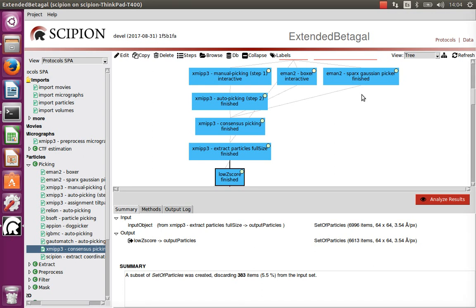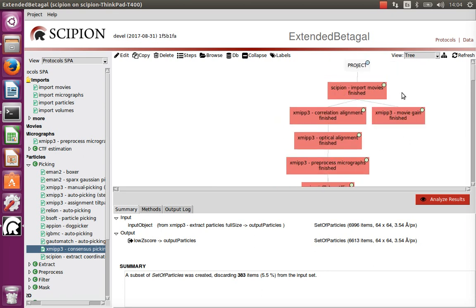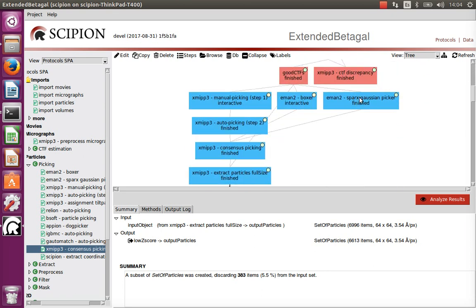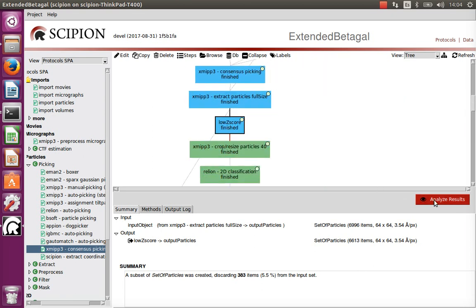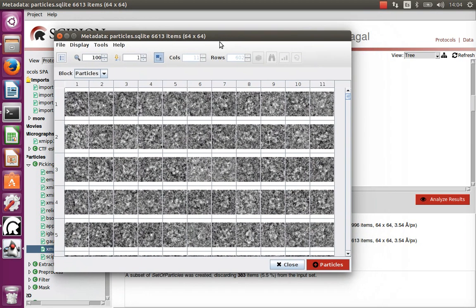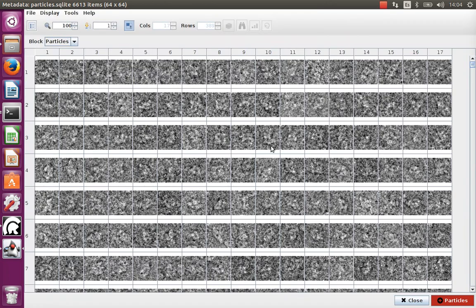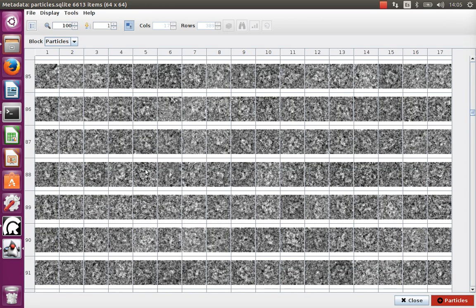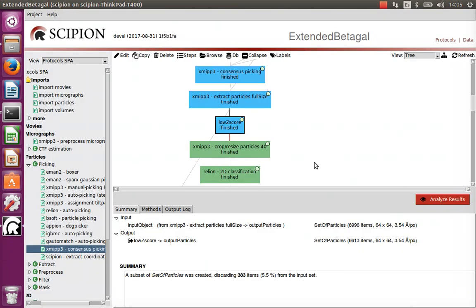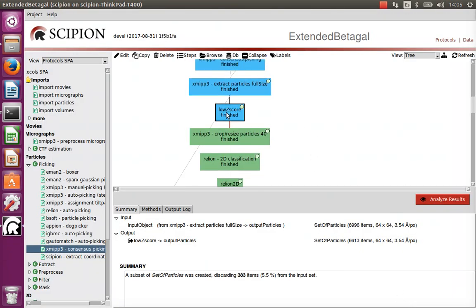We continue with our tutorial on the processing of the beta-galactosidase images. We had already performed the micrograph processing; from these micrographs we had extracted some particles, rejected some that were strange, and at the end what we have is about 6,000 particles that were picked by a couple of algorithms. In the gallery they look like standard particles — white particles on a black background.